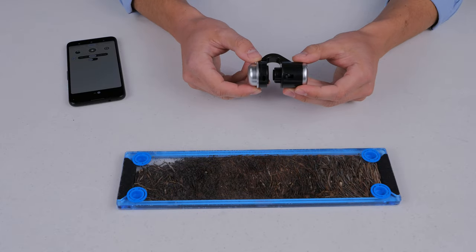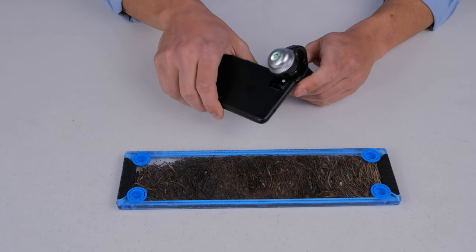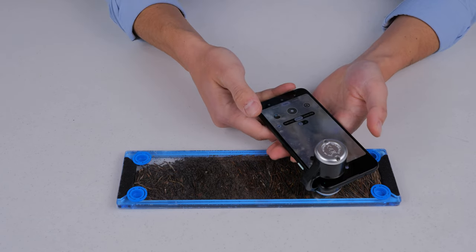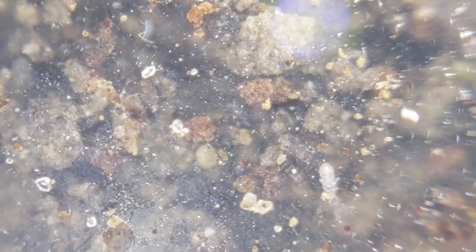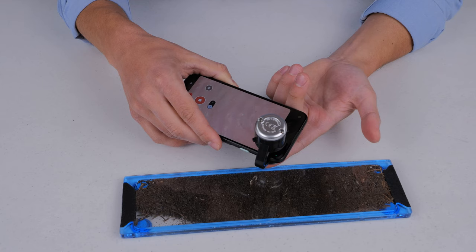First up is the smartphone microscope. If you've watched any of my videos you know I love these things — they're super handy and convenient. I'm putting it on one of our Micro Safari Terra slides and we can see a little mite running around. I'm also showing a $20 bill; you can see the sparkliness of the ink. Here's what my fingerprint looks like under it, and if you look closely you can actually see the sweat pores in my fingerprint — pretty neat.